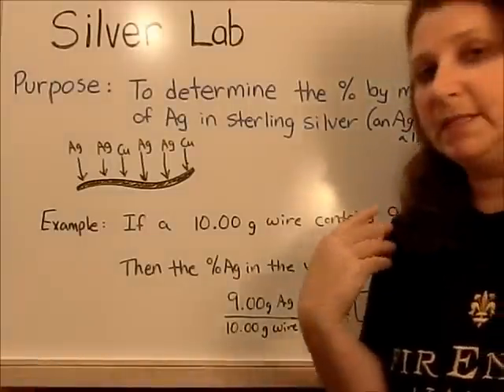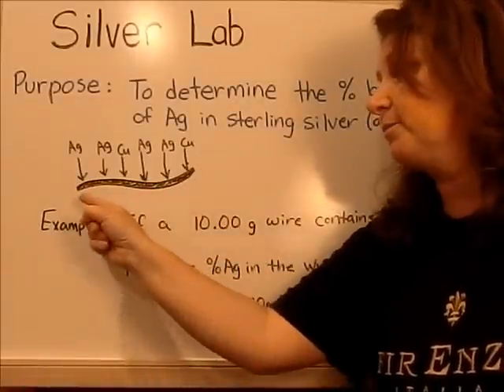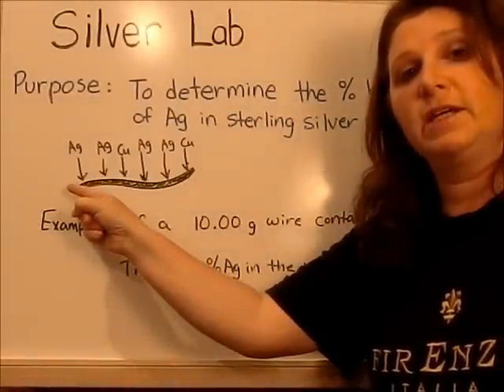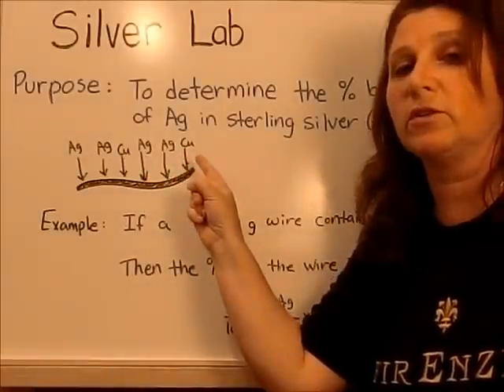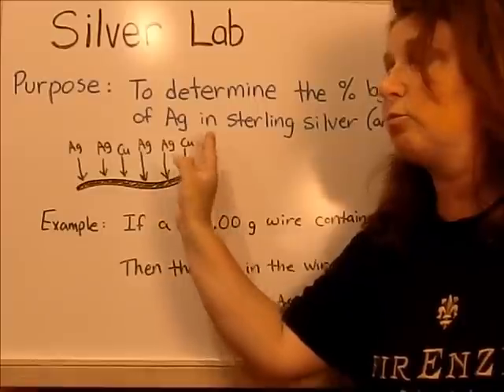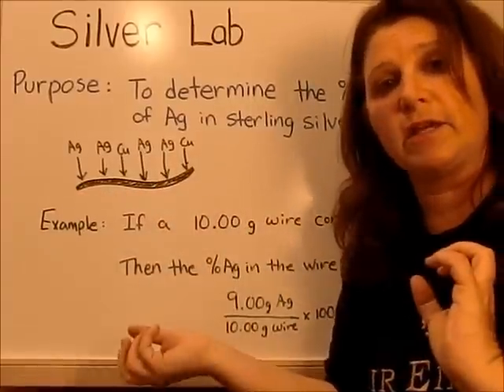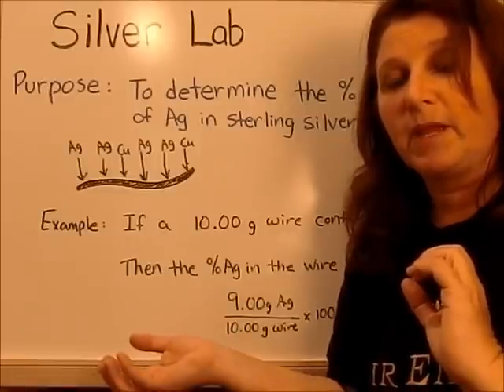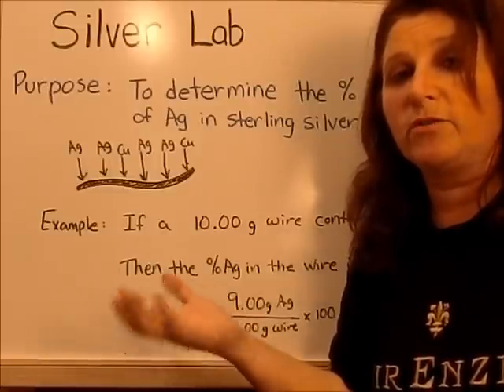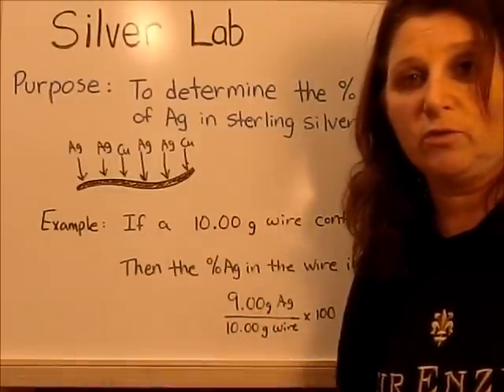So you will be starting off with a wire, and it is made of a bunch of silver atoms and a few copper atoms. It's mostly silver. So your job is going to be to break that apart, separate all the atoms, and find out the weight of just the silver. And out of the total weight of the wire, the weight of the silver over the total weight is your percent.